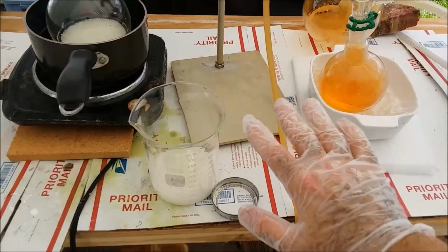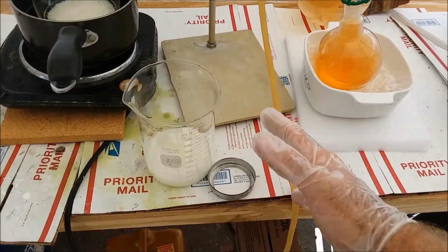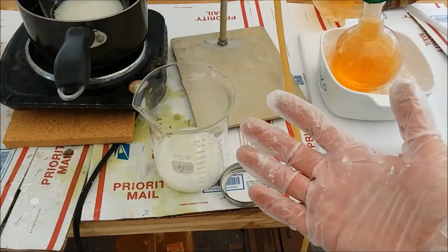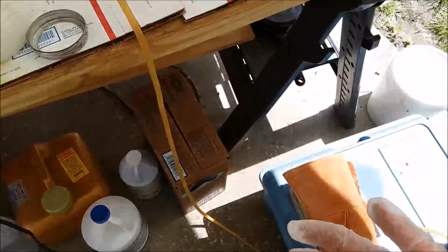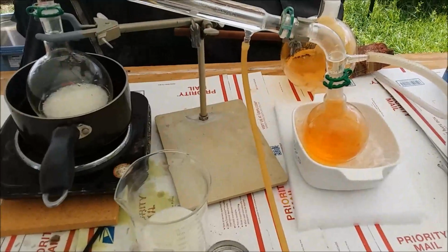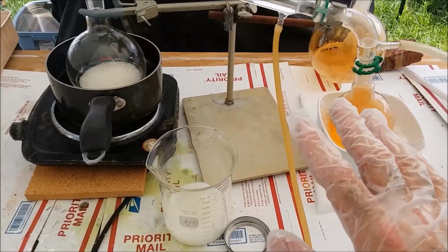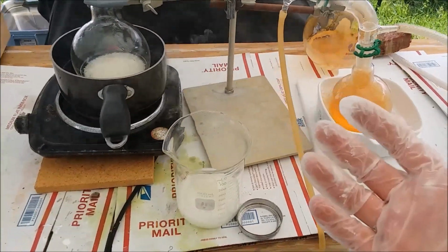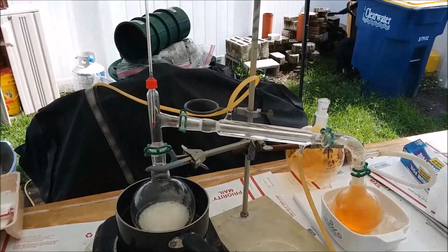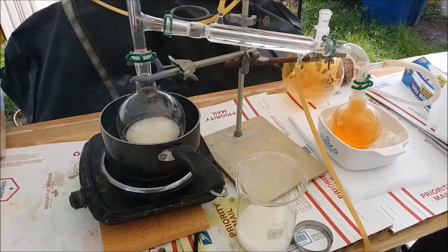Oh, and by the way, I am wearing vinyl gloves, which according to some YouTube videos I've seen are not attacked so badly by concentrated nitric acid. But just to be safe, I'm wearing the leather gloves over them while I'm working with this stuff, just in case. Plus, of course, it's hot, and these don't give me any protection from the heat. So I'm thinking the leather plus these, I'm pretty well protected, but I'm still not taking any chances. I don't need any more nitric acid burns. Don't need to start a fire. So I'm being really careful.